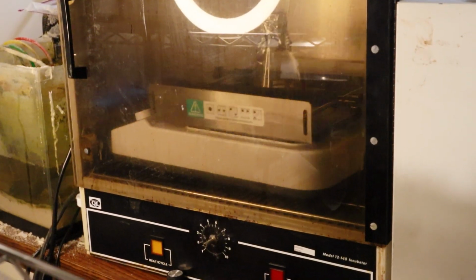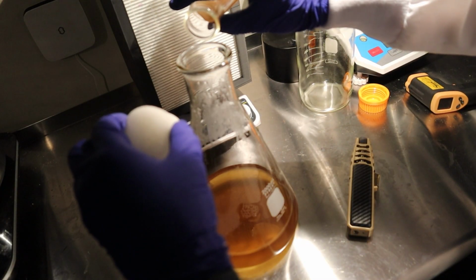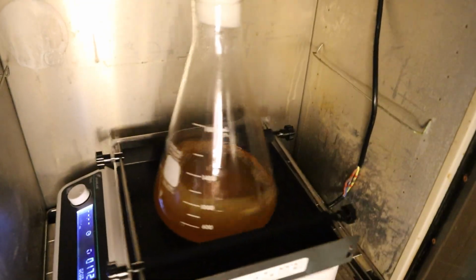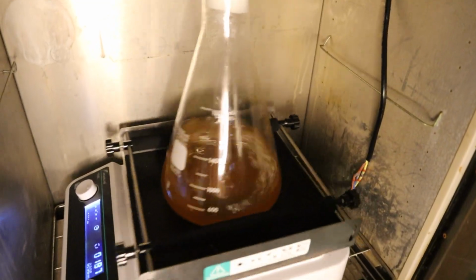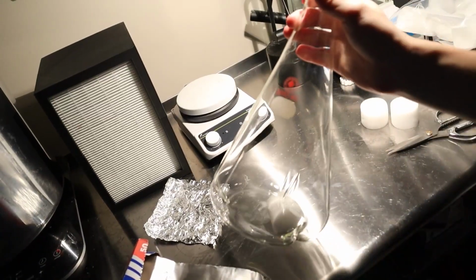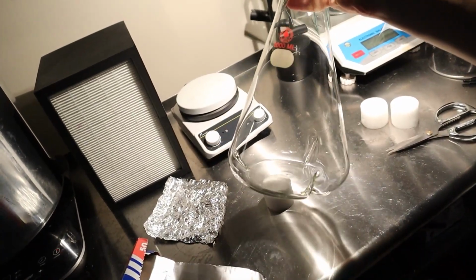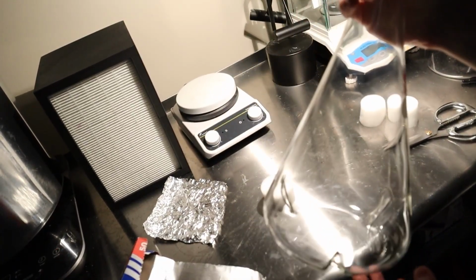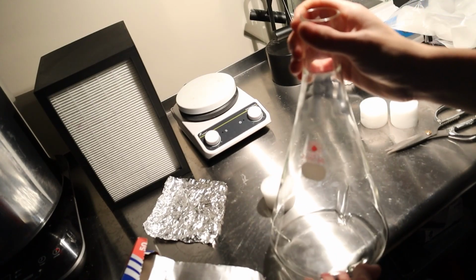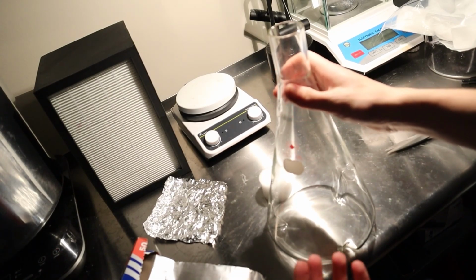After 2 days, I very carefully transferred the culture media to the bigger 2-liter flask and 600 ml of fermentation broth. And while that was incubating, someone suggested to use a special flask called a baffle flask, and I agreed. I got this cool flask. It's called a baffle flask. It has these things on the bottom called baffles. They're supposed to increase turbulence, which increases aeration, which increases oxygenation, which increases the amount of streptomycin I get out of the Streptomyces bacteria.